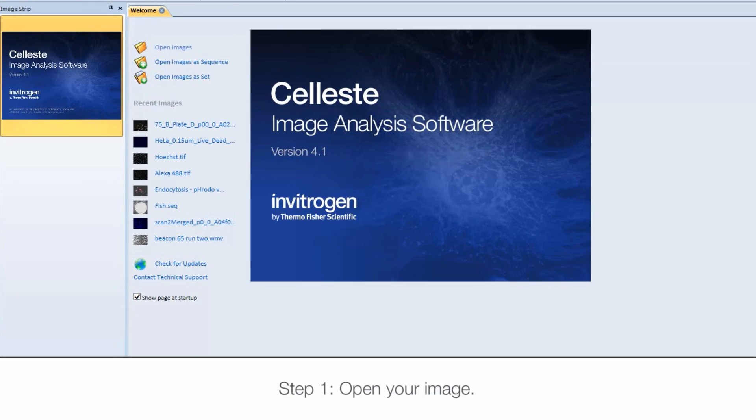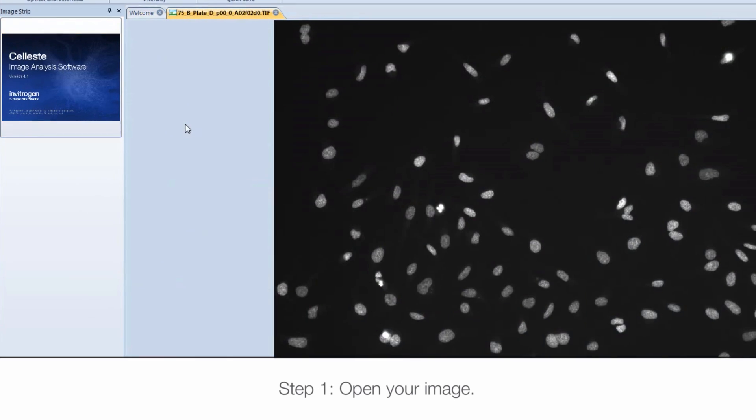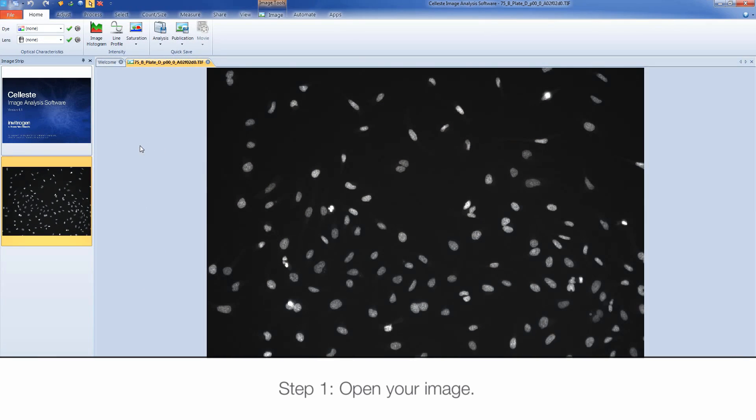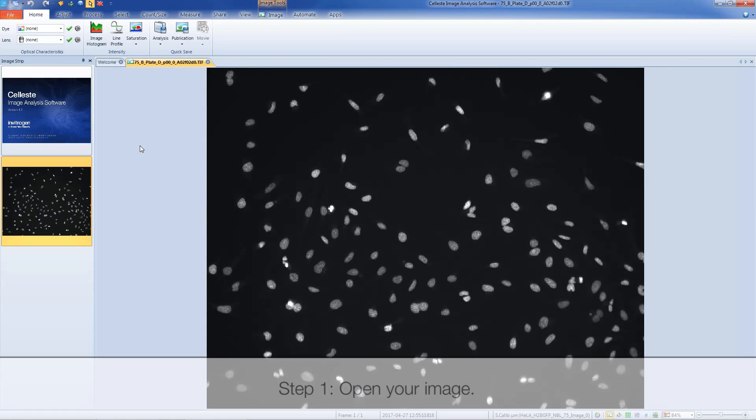To begin, open an image you wish to analyze. When setting up macros, you want to avoid recording this image opening step in your analysis.